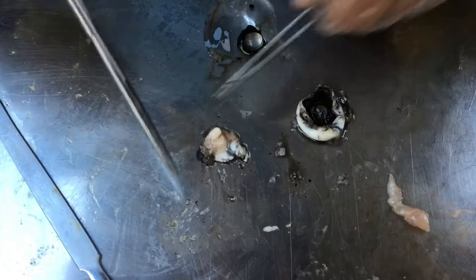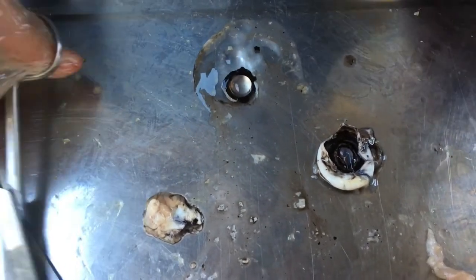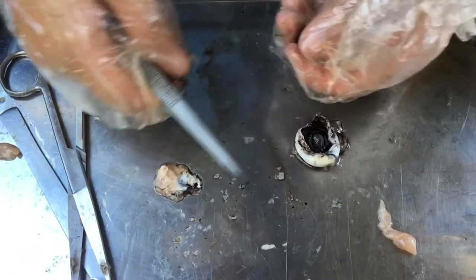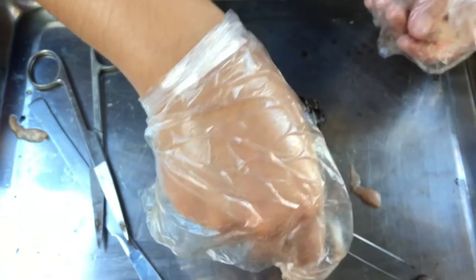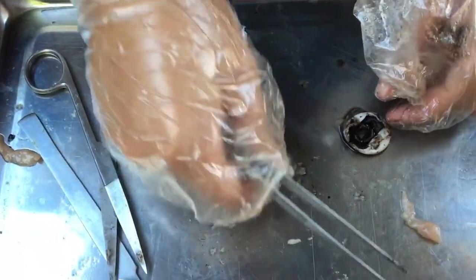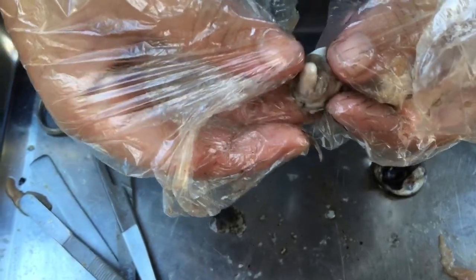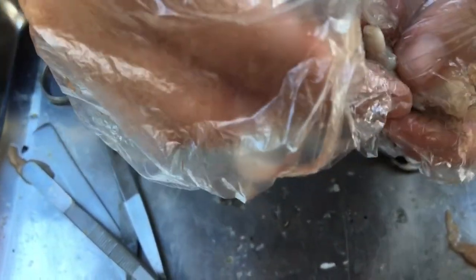Now we have already cut the eyes. As I said, the jelly part here is the vitreous humor, and this one here is the lens. At the back of the eye, you can see this circle here, the circle that's sticking out on the back in the middle. This little lump there is the optic nerve that will carry all the signals from the receptors to the brain.